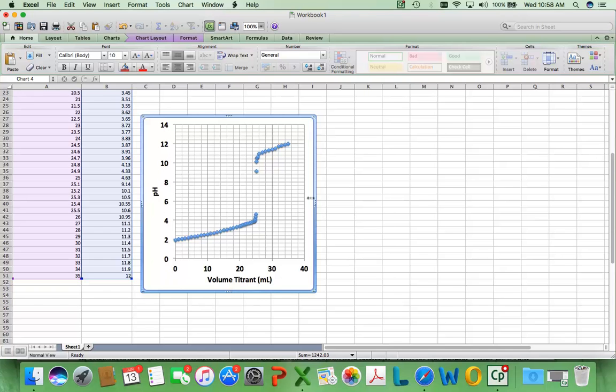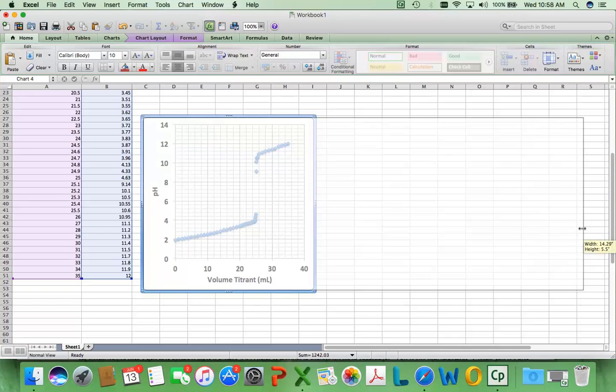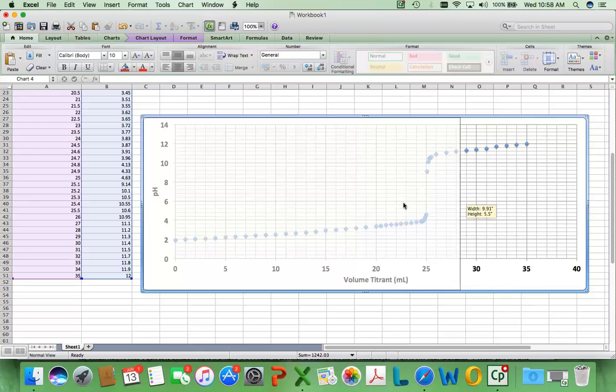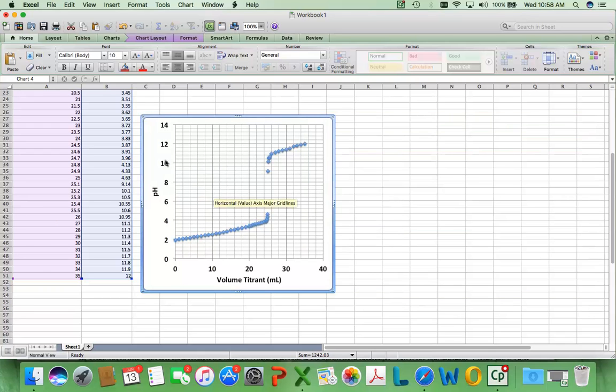What you generally don't want to do is something like this, where your X dimension is 2 or 3 times the width of your Y. I guess it looks kind of nice to the eye, but you're really stretching that X dimension. And usually we're looking for linear trends and things of the sort. So it's nice when there's a 1:1 aspect ratio and your plots appear square. So just some minor things there about making plots.